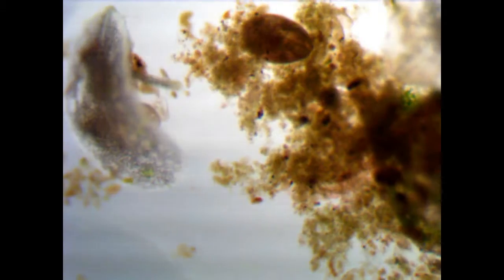As always, I find myself enamored with organisms like the mystery organism from Ichor 1. I think this is perhaps the same kind of organism. I'm not sure. I still think that it could be an insect larva. And if you'd like to know more about this organism, you can click the link. But it's got a really cool intestinal tract. It sort of undulates, which is a 50-cent word that means it moves in a wave. I suppose I could use a different word, but I guess that's the proper word, so I'm going to stick with it.